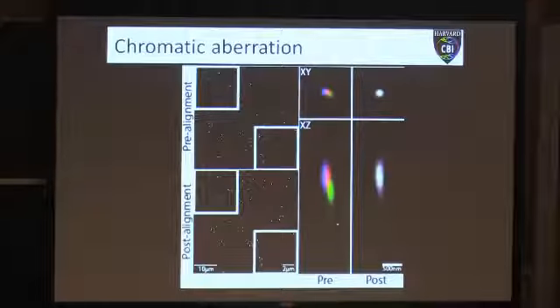And this is even worse in the axial dimension. Looking at Z, here's our blue, here's our red, here's our green. This is what's called chromatic aberration. The software has a nice way to correct for this. Once you do this post-alignment, all of these beads become yellowish white, and everything gets realigned with blue.